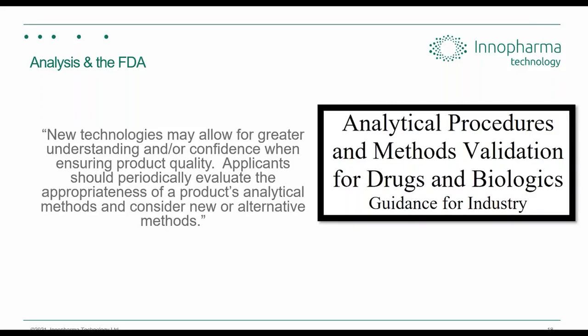Okay, so that was a real quick run through of essentially what particles are, how to measure particles, different methods of measuring particles, and why you might switch from one particle method to another, and how you might actually go about doing that with guidance from the FDA.